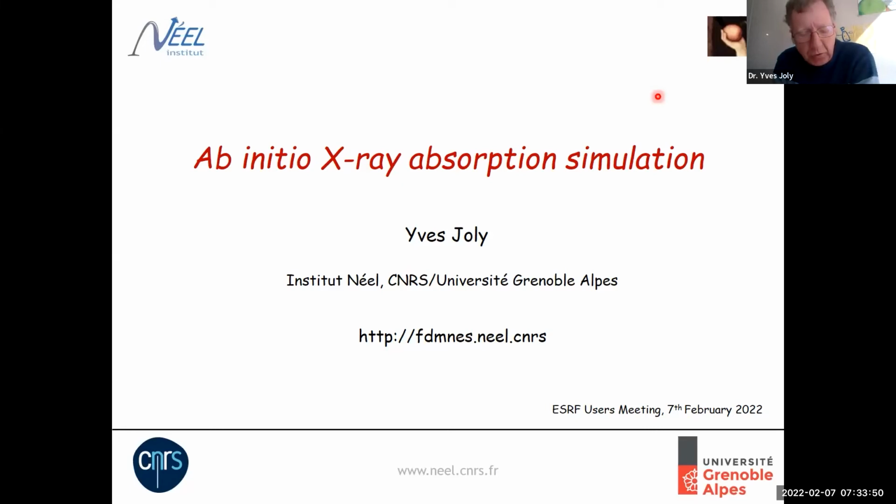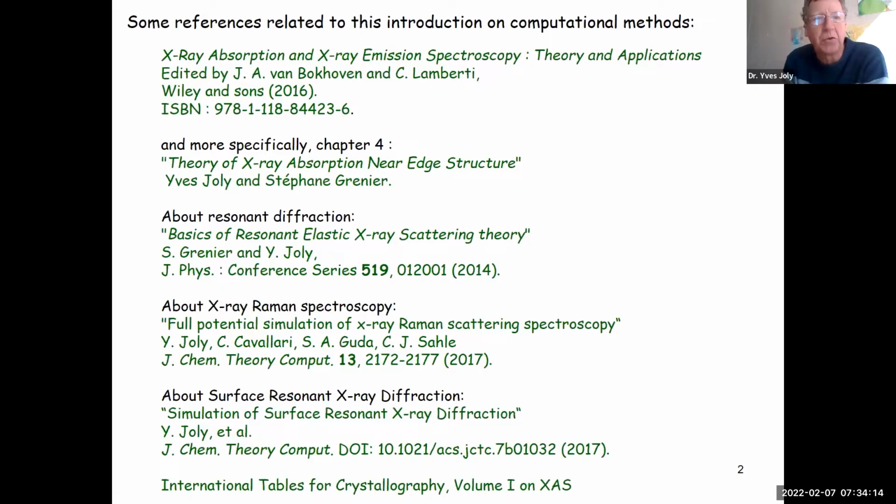This tutorial is to teach you to make XANES and eventually some other spectroscopy simulation, ab initio simulation. And to start, I'll have a very small presentation, maybe 10 minutes, something like that, to explain a bit my philosophy. And I guess you also followed the course this morning about XANES, so you know different things.